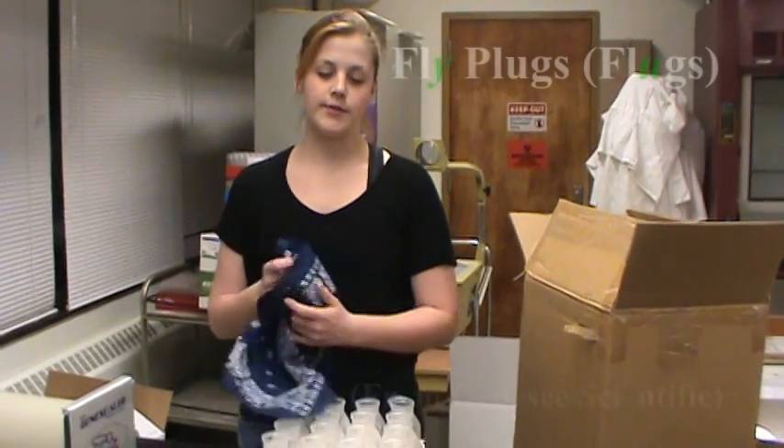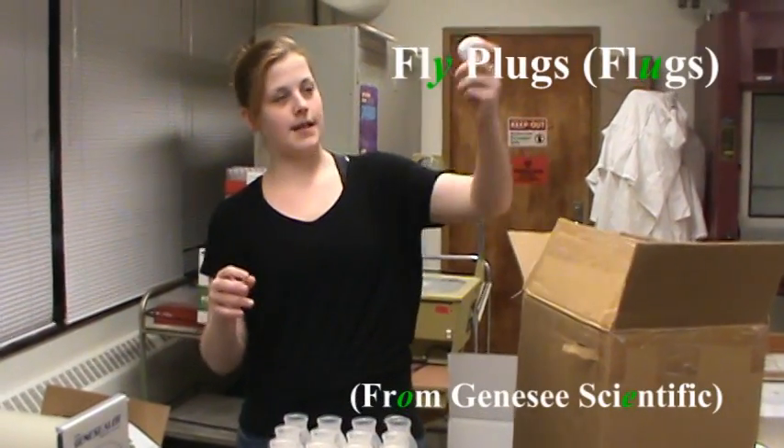Now that we've wrapped the vials, we are going to stop our bottles with Genesee Scientific stoppers.